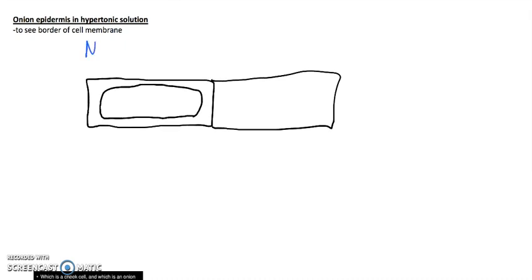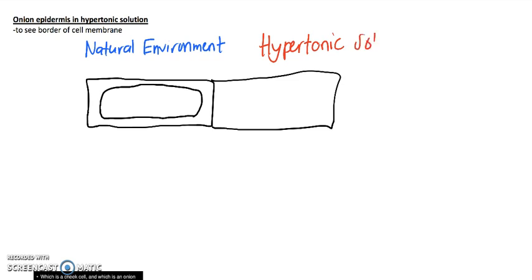So we'll say in its natural environment. But on the right is going to be one placed in a hypertonic solution.